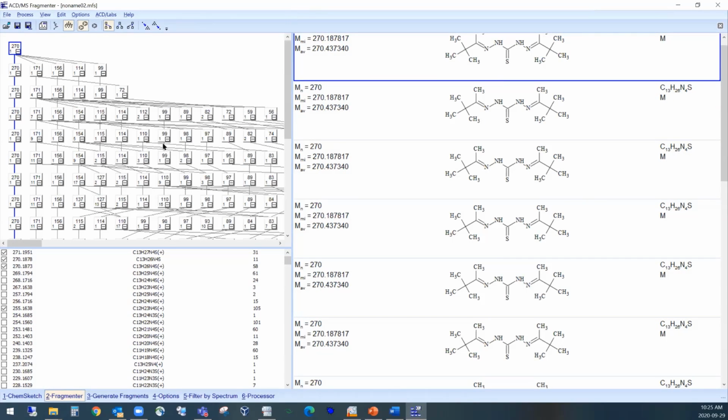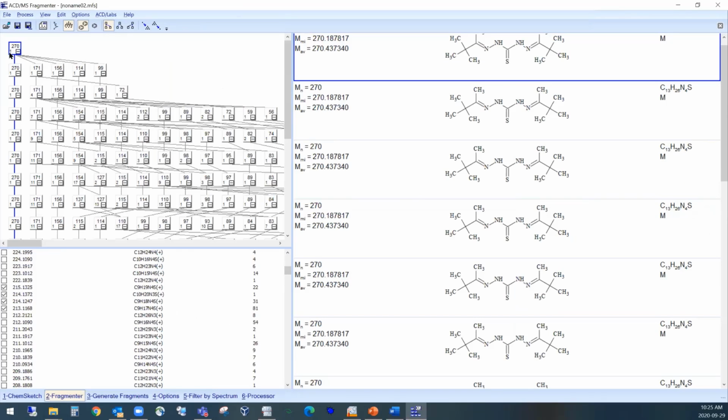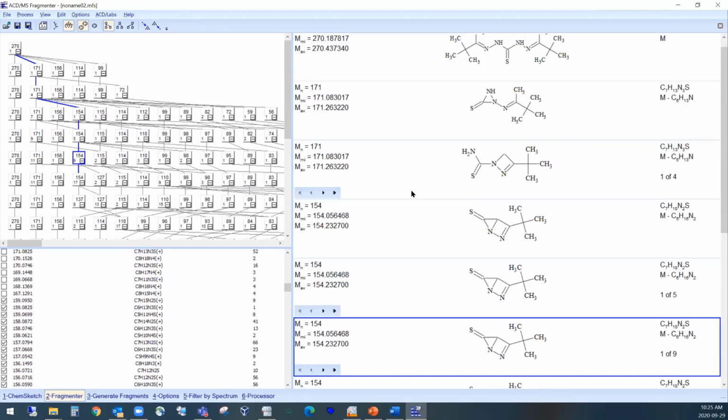There we go. So as you can see, what it has done is tick the relevant ion boxes, similar to what we did before manually, but this time, it's found these relevant masses in our mass spectrum. And it has just simply narrowed down the list in the fragmentation pathway to only include ones that are present in the mass spectrum. So we can be fairly confident that these ions are real possibilities in terms of what might actually be happening in the mass spectrometer.